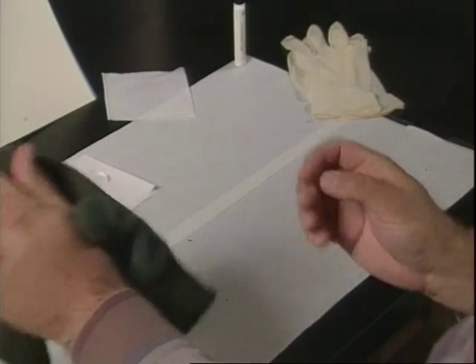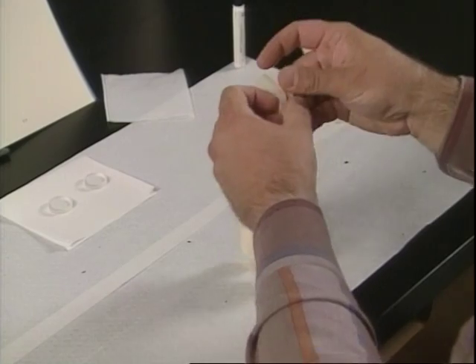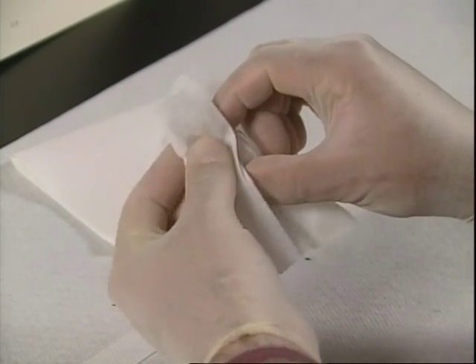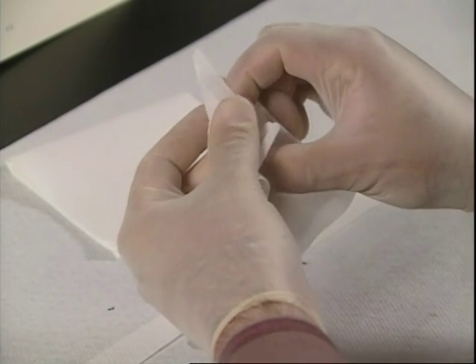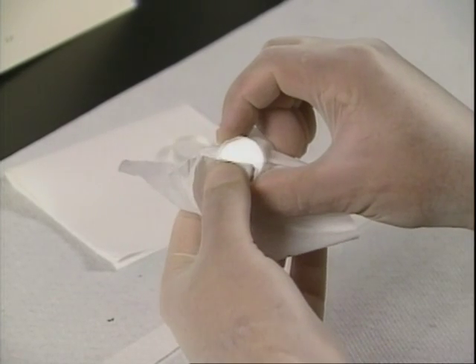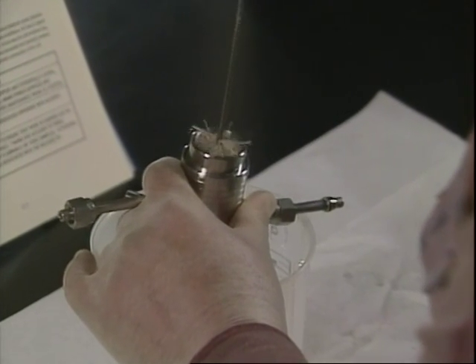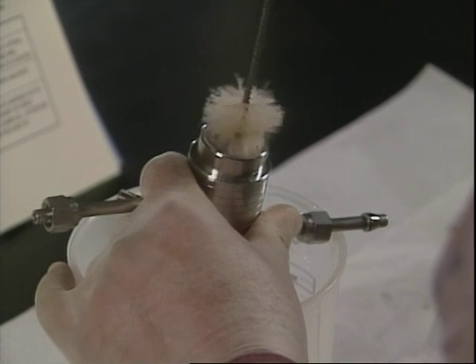Now, clean the cell components. First, change gloves to a chemical-resistant glove and clean the cell windows with lens tissue or a soft towel and a detergent or solvent such as isopropanol. Do not use abrasive cleaning compounds which may damage the optical surface. Clean the inside of the cell body with an approved cleaning solution and brush. Ensure that all deposits are removed.